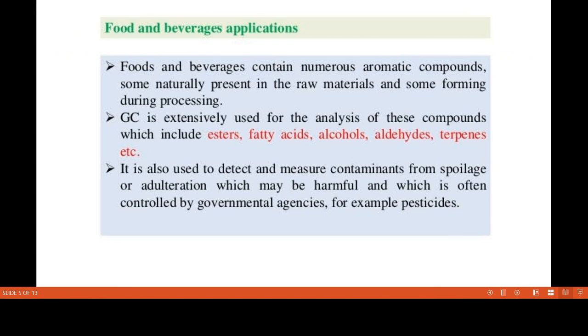Okay. Then another application of gas chromatography is food and beverages. Food and beverages contain numerous aromatic compounds, some naturally present in the materials and some forming during processing.